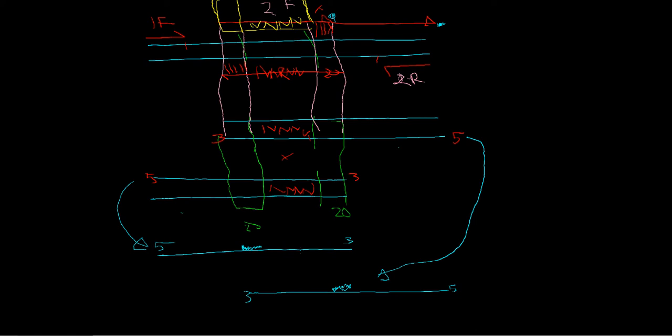But now we're going to be using that other overlap area. So we had this other overlap that we just put there for some reason, and this is what's going to allow us to sew together our stuff. So we're going to be using that one and that one, the very 5' extremes. So we don't have any homology here. These ends are just dead space. Nothing is going to help us out here.